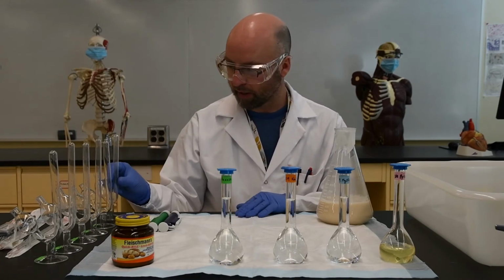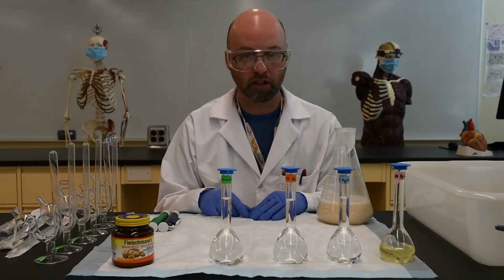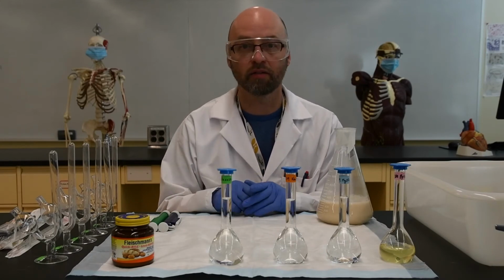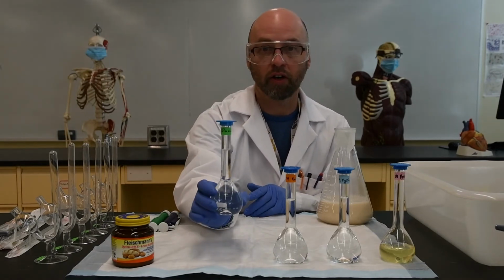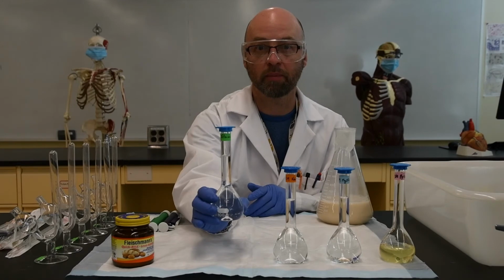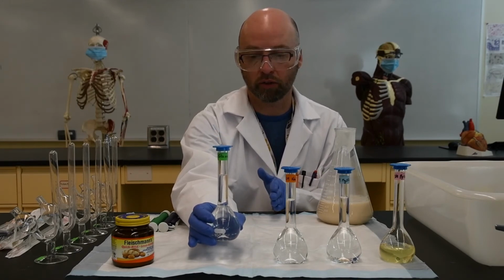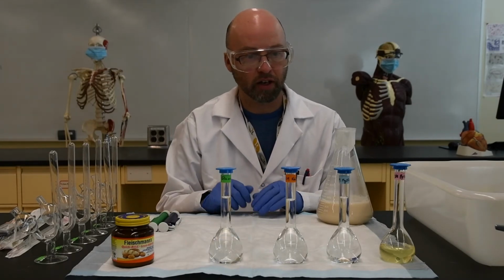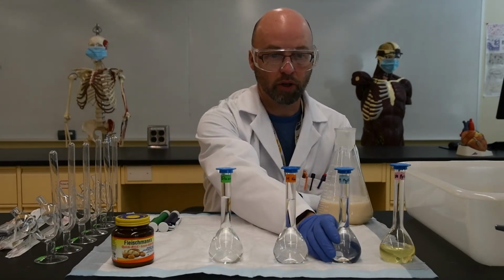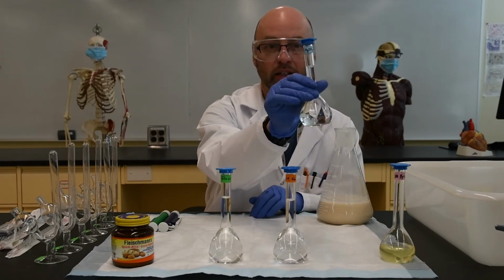So basically, as you can see, I've got a bunch of different solutions here to set up 6 different tubes. All the tubes are going to have 5% glucose in them, since I mentioned that the process starts with the breakdown of glucose and glycolysis. In some of the other tubes, we're going to have a cofactor known as magnesium sulfate.